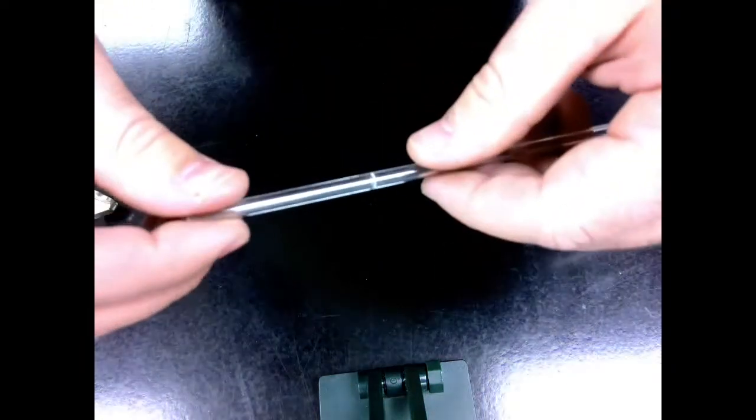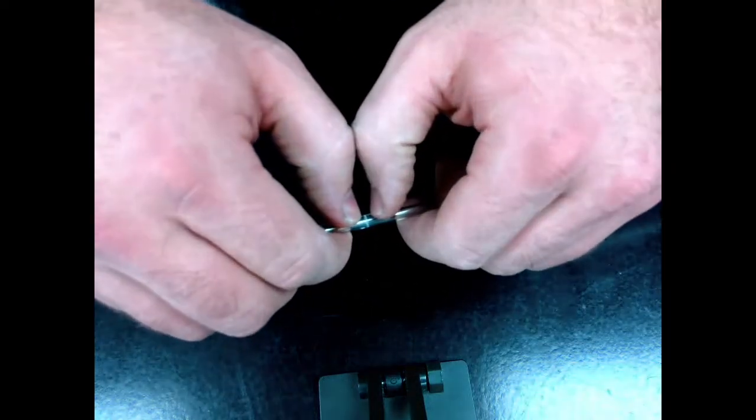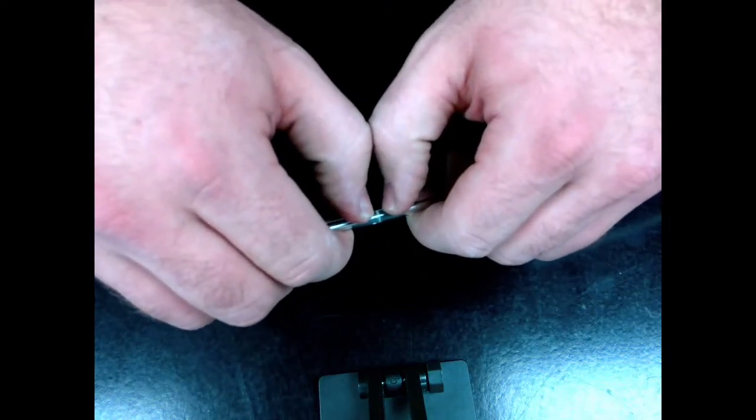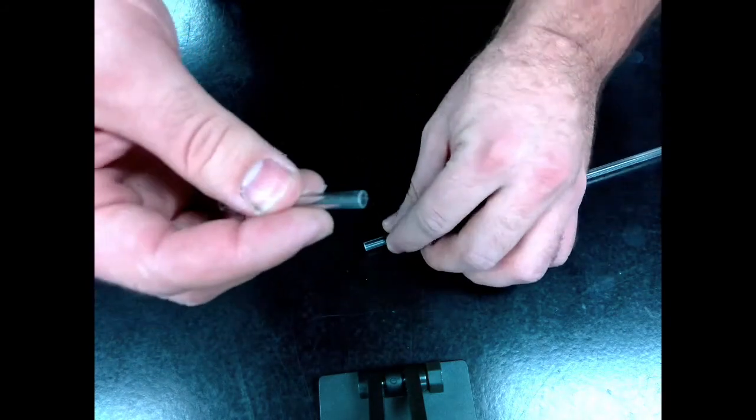Once I have this ring all the way around it, this is going to give the glass a specific point to break on. So if I take the glass like this and break it along that line, I get a clean break. And so now I've got a flat surface.